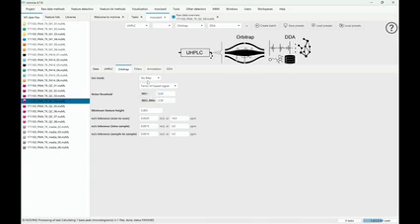So here we go, no filter, factor of the lowest mass detection. We're going to filter out some noise. For MS1, the noise is typically a little bit higher, and we can filter out more signals with 5, and then for MS2, 2.5. These are the default settings, you don't have to change them. Minimum feature height very much depends on how low you want to go.